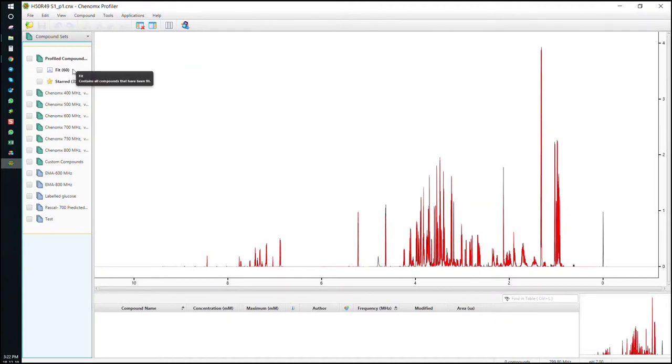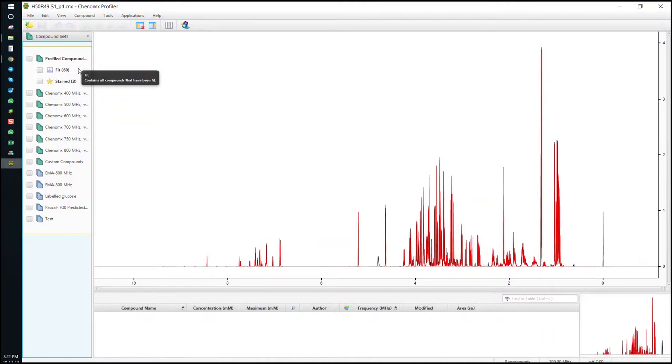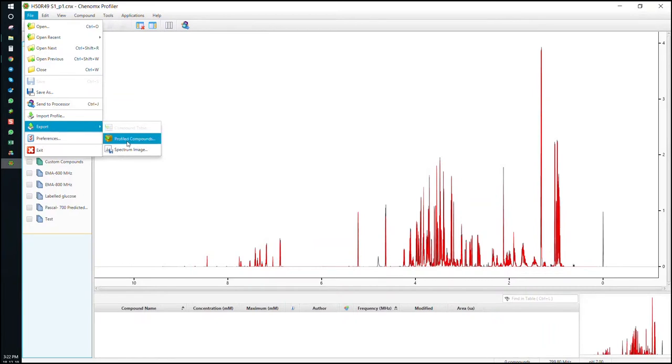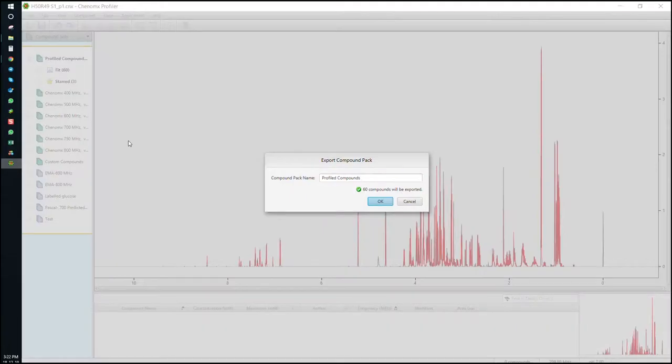We want to save this list and access it through the library manager. So we'll create a PAC file. Click File Export Profiled Compounds. We'll name it PAC file 1.